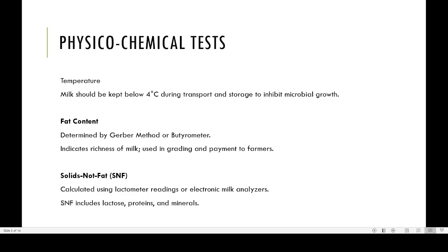I will show you, it's a very simple thing. Lactometer, I will show you a picture of a lactometer. Lactometer is a very simple one. Even on Amazon you can see such kind of apparatus. See, this is a very simple device. You can see this is how we put the lactometer into it, so that we can get an idea of how much water is present in that.